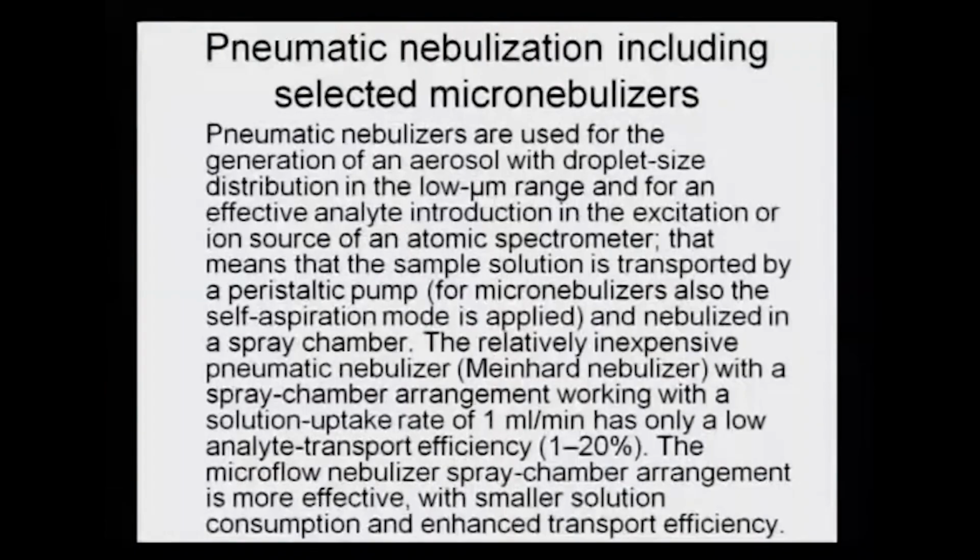Now, again, time and again I have told that different methodologies are adapted for the best kind of analytical method development, and if special considerations of the machines have to be taken, then they are designed accordingly. Pneumatic nebulizers are used for the generation of an aerosol with droplet size distribution in the low micrometer range and for an effective analyte introduction in the excitation or ion source of an atomic spectrometer.